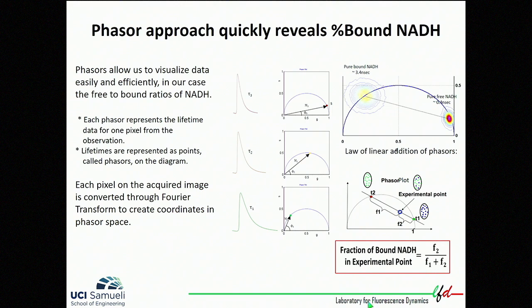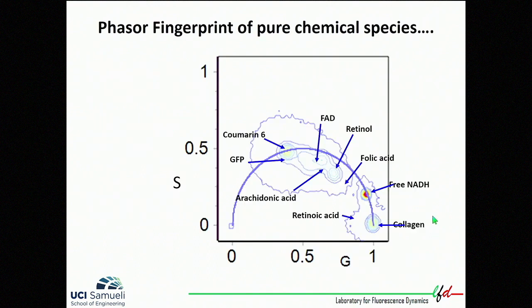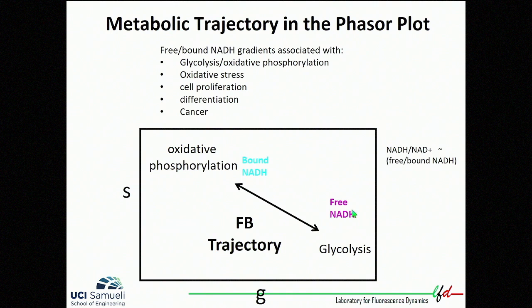So in our examples, you're going to see how we've calculated a fraction of contribution of the highest concentrated fluorophores in tissues. Maybe you've gone to image and done some imaging on tissue, and you've noticed this very high background signal. And that's the contribution of NADH. And so we can calculate the fractional contribution of free and bound NADH. And using this polar coordinate, you can see the actual signature of each different type of fluorophore within cells.